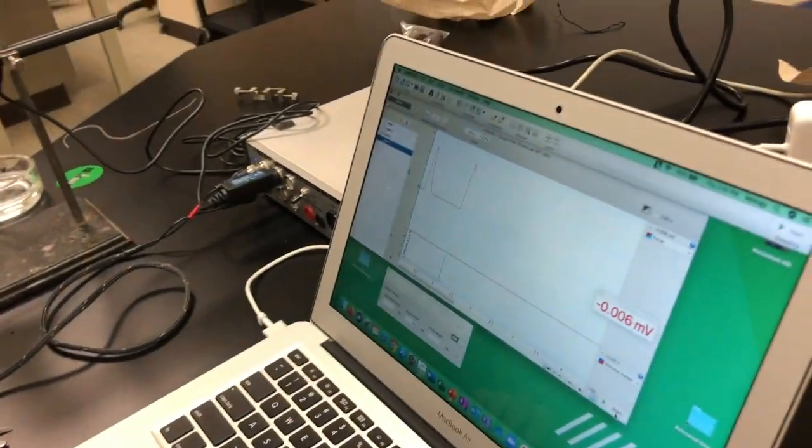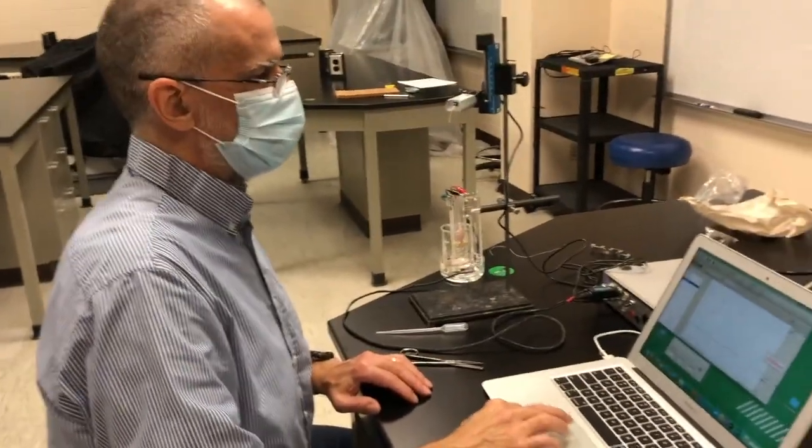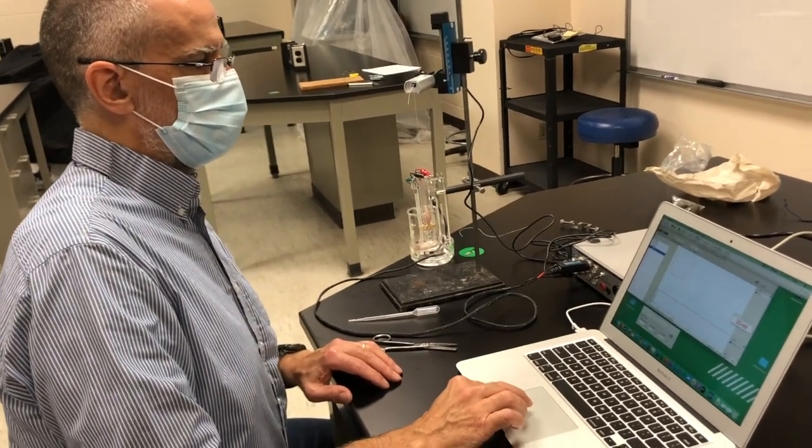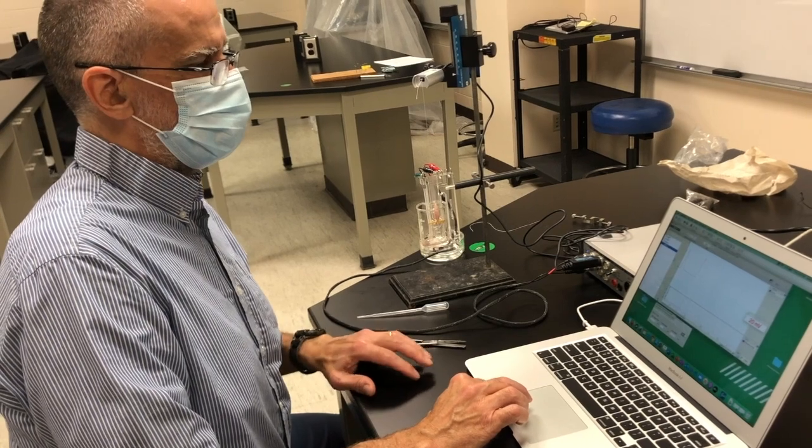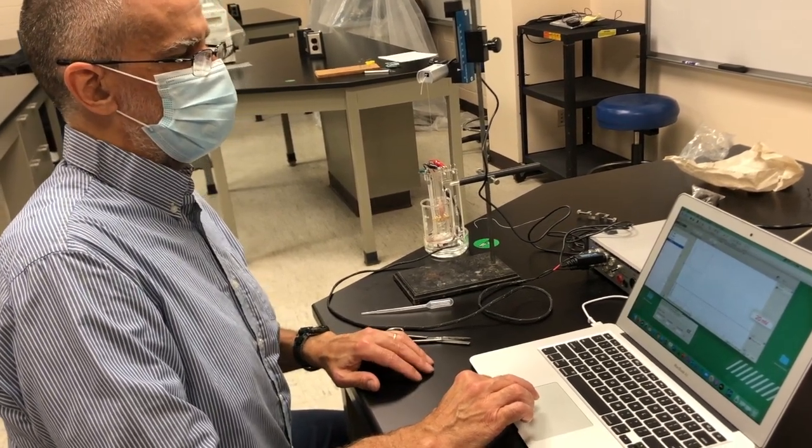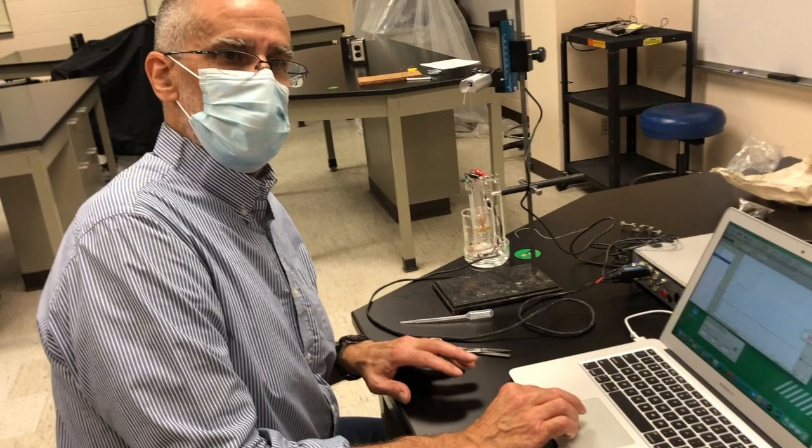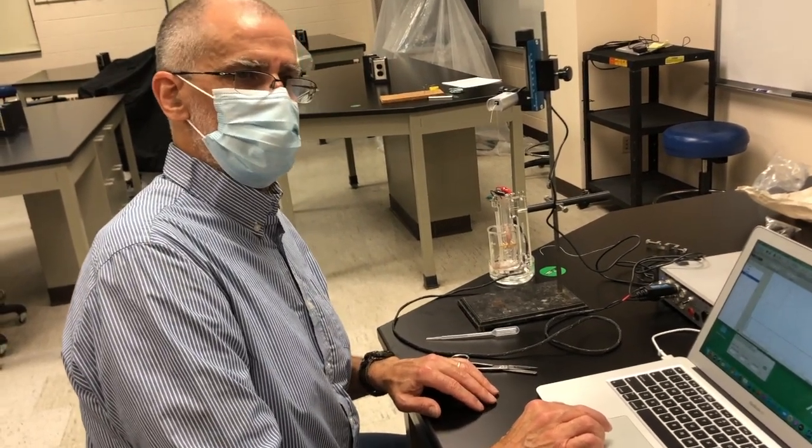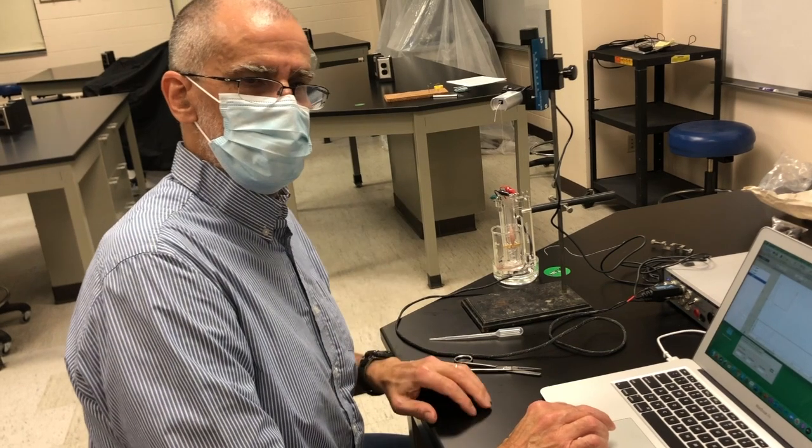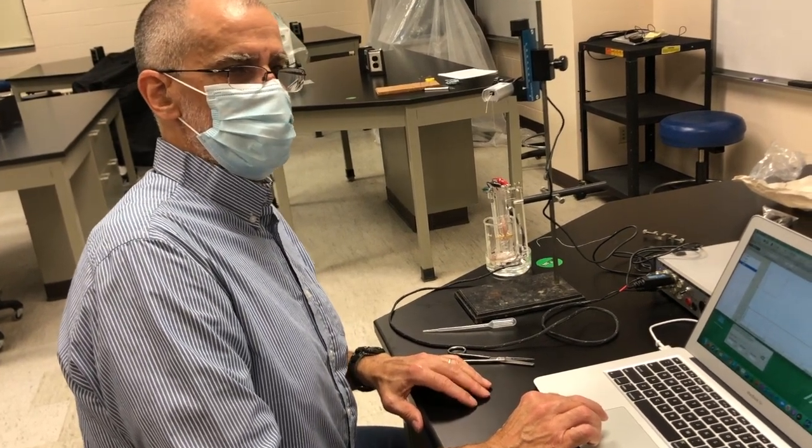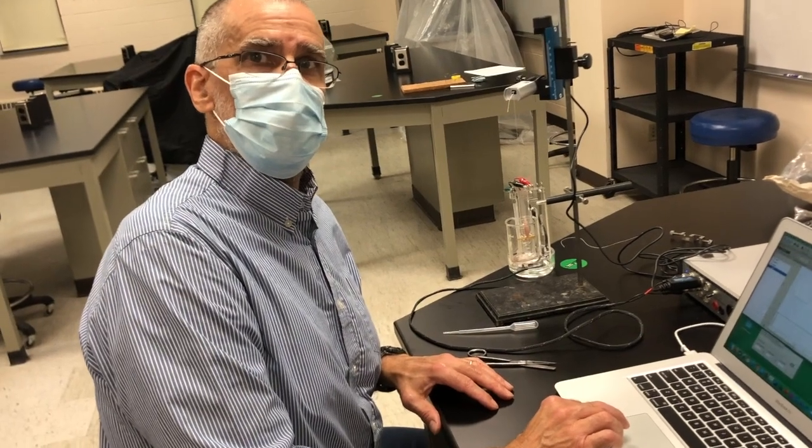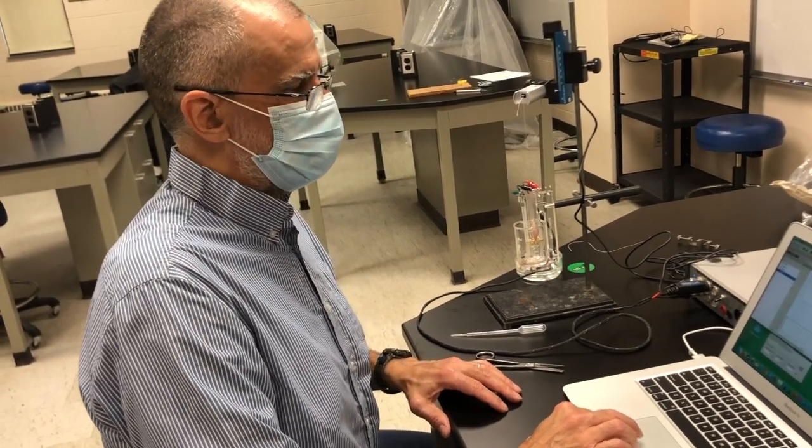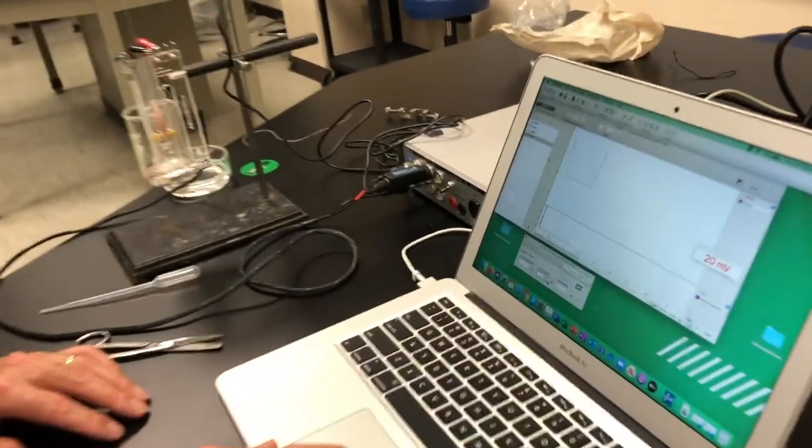But you went up from lower voltage and you can measure this. We can kind of measure this with the M and the cursor as we've shown before. But the point is you can kind of see how you increase twitch strength by increasing the magnitude of the stimulus to it. And that only goes up to a point and that gives you the maximum amount of force you can do with a single twitch.